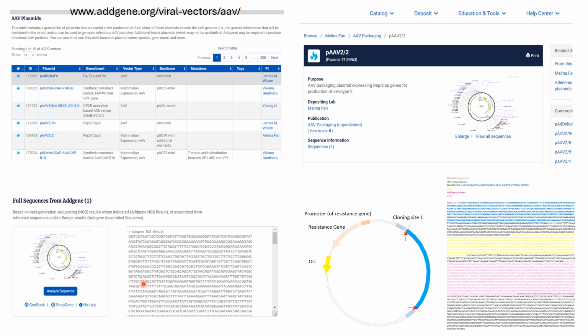So if you want the sequence, the only thing that you have to do is copy pasting all this sequence. You select the sequence and copy paste to a text editor, as we have done in here. You see here, this is Word. So the only thing that we have done is copy pasting here from here to here, and this is a view that I have generated. Okay, I have done it in PowerPoint so that you can see it better.